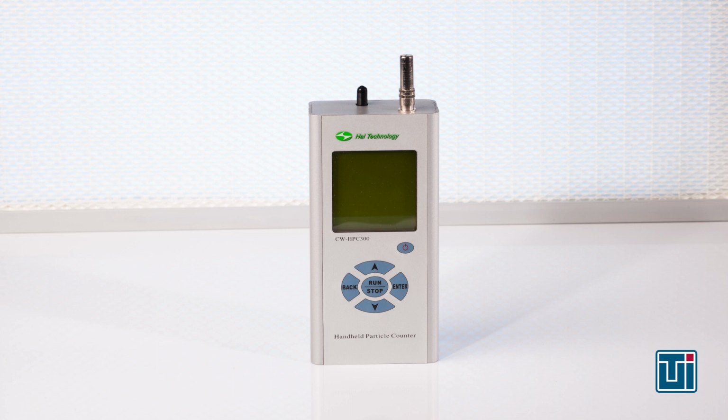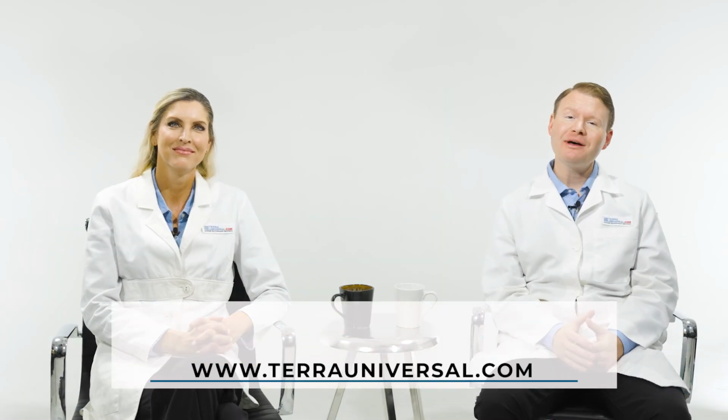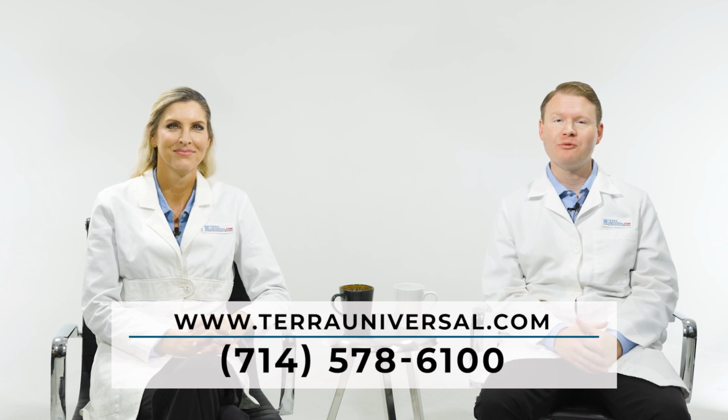The ISO classification is validated by particle measurements performed with a benchtop or handheld particle counter. Traditionally, particle counts are performed 6 inches underneath the filter face, but certain standards require particle fallout tests, which are performed at desk height. For additional information, please visit Terra's website or call the number on the screen to discuss your requirements with Terra's technical sales team.